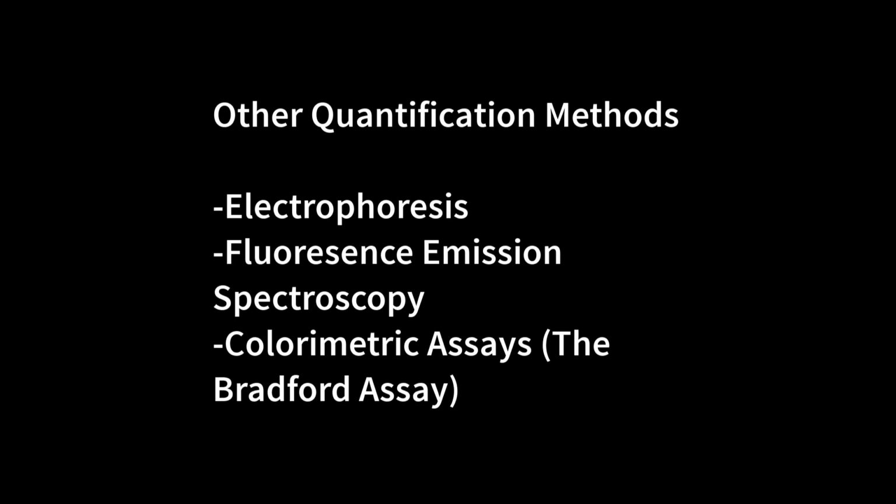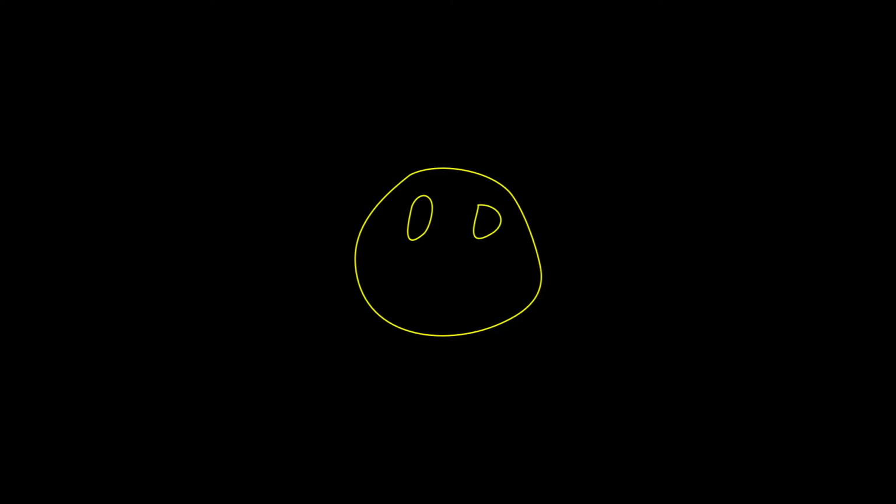There are many common methods of protein quantification, such as electrophoresis, fluorescence emission spectroscopy, or colorimetric absorbance assays like the Bradford assay. A280 is one of the simpler methods, and if done properly, can be both time and cost effective.